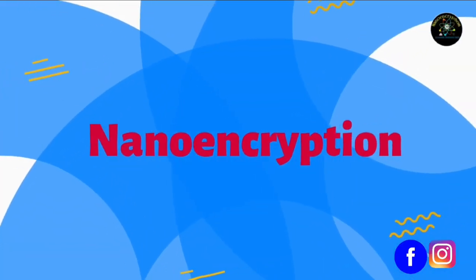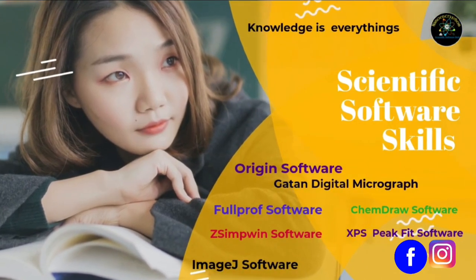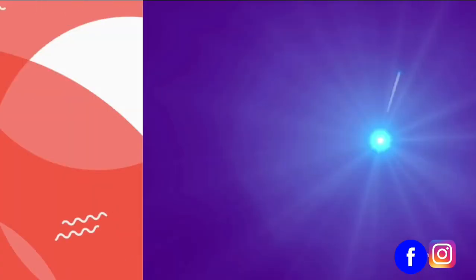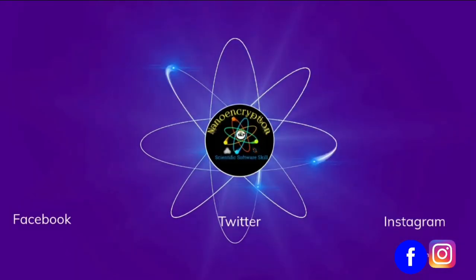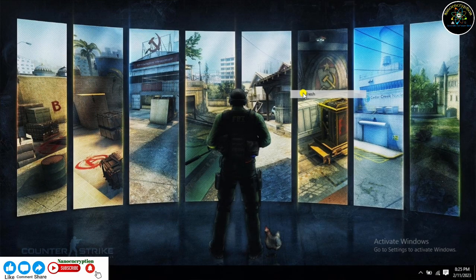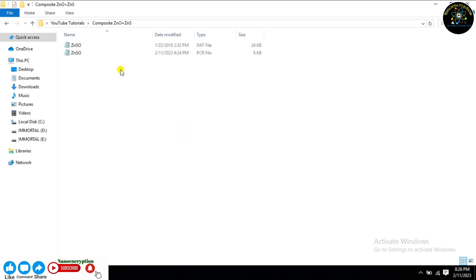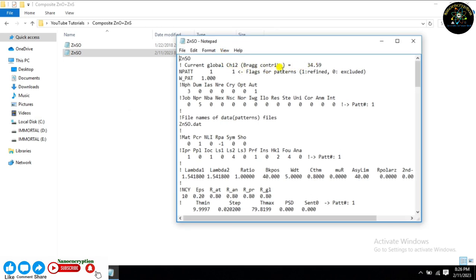Welcome to Nano Encryption. Today, in this tutorial, I will show you how to run Rietveld refinement of triple-phase zinc oxide plus zinc sulfide — that's a composite material — using PCR files via FullProf software.